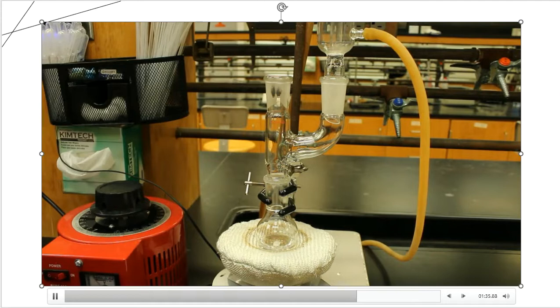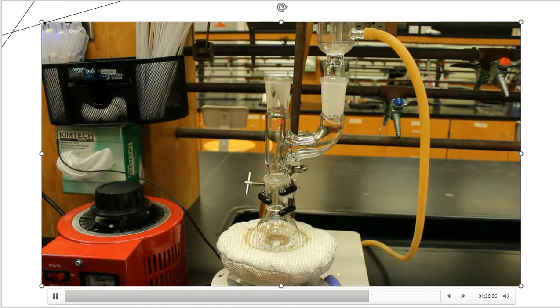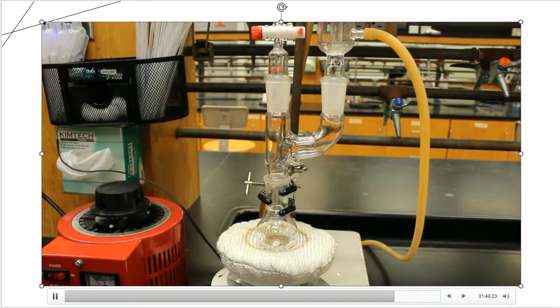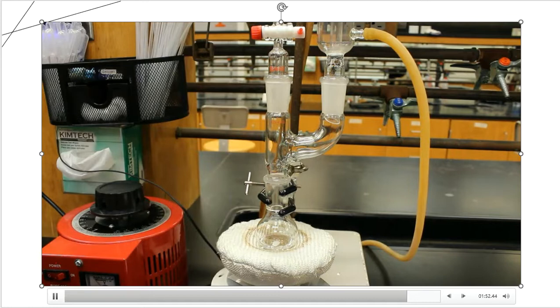All right, so the anisole, the methylene chloride is there, and we're going to turn on our stir plate. And we're going to get that magnet going. So I'm going to put this separatory funnel back on top. Again, I don't want any water moisture to get inside of here. I'm going to prevent it every possible way that I can. And then we're going to let this stir for just a couple of minutes, and we're eventually going to add our aluminum chloride to this.